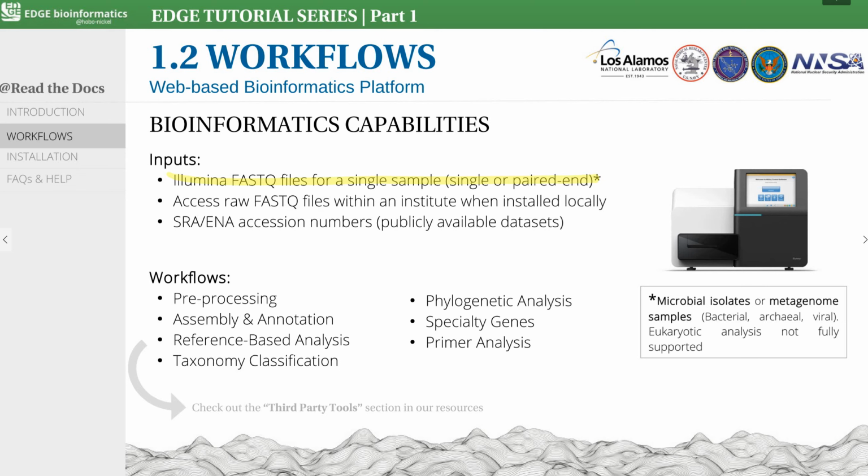As a side note, EDGE parameters have been optimized for data coming off of an Illumina machine. If you have data from other sequencers, feel free to contact our team to see how our pipeline can be customized for you.